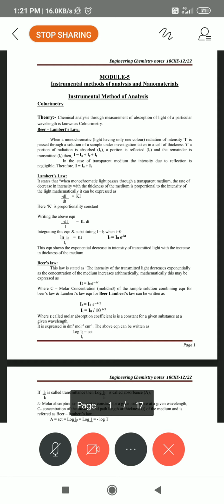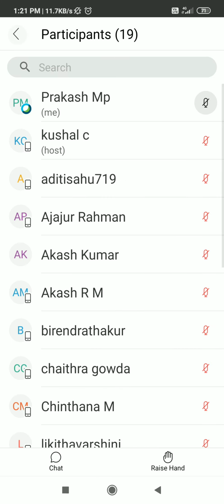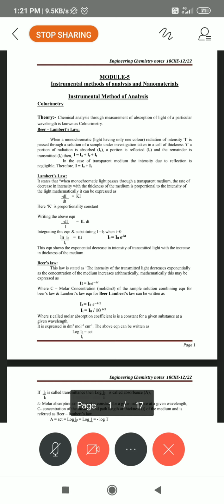That is the last one, the sixth, which we call the test solution. Before that, prepare one more 50 ml flask, a blank solution. To that, don't add the sodium fluoride. Add only 10 ml of Spadns reagent and 1 drop of sodium arsenite, followed by 40 ml of DM water.